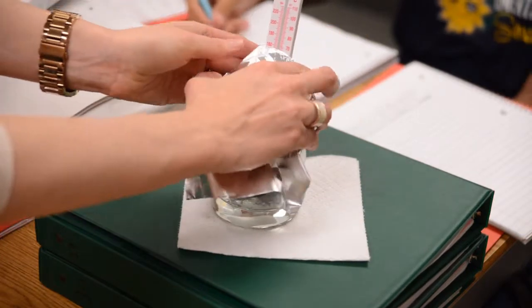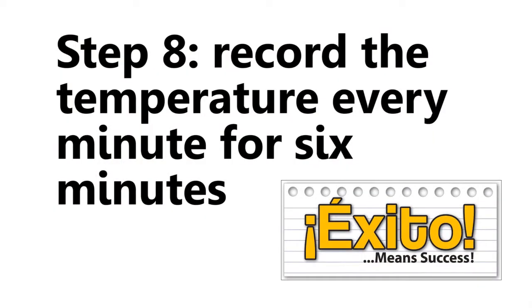You guys can go ahead and get started because you're going to want to record the temperature for each minute, okay?